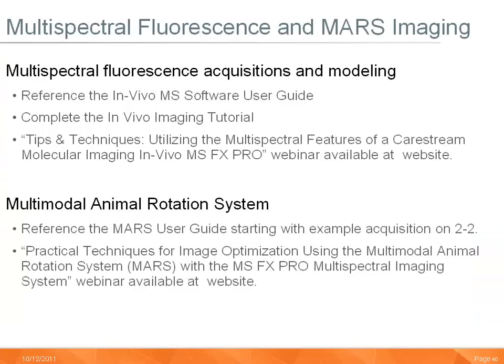A complete description of multispectral fluorescence acquisitions is really beyond the scope of this webinar. I recommend referencing a few existing resources for details regarding multispectral fluorescence acquisitions. Number 1, reference the In Vivo Multispectral Software User Guide. Number 2, complete the In Vivo imaging tutorial provided with your system, which includes sections that allow you to practice the process of a multispectral acquisition and subsequent imaging.